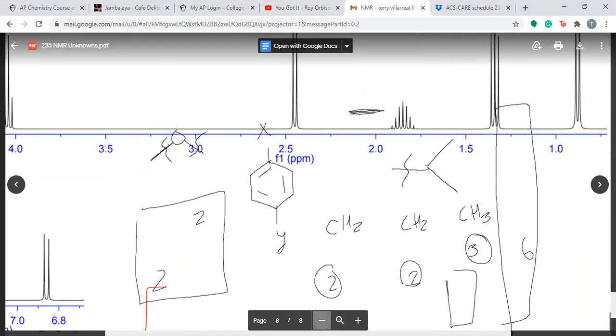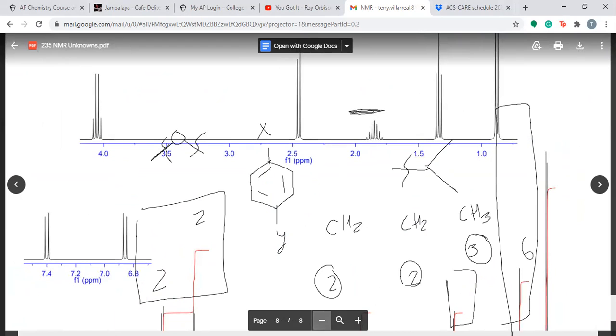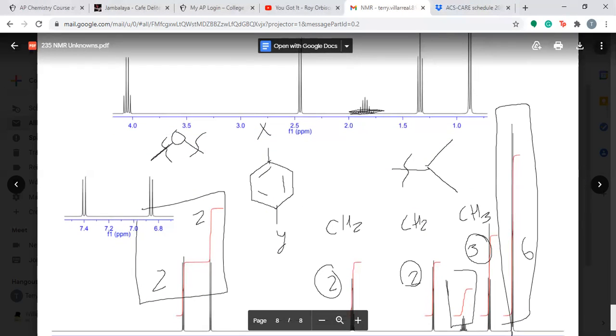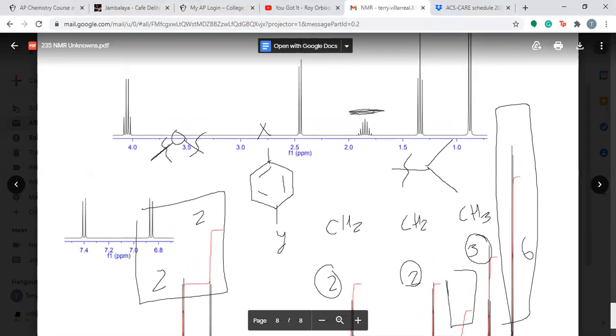CH2. Yep. So now I'm going to have a CH2, correct? Yeah. So now that I know that I have a CH2, as I scroll back down here, which CH2 do you think is going to be the most likely culprit? This CH2 that's a doublet, or this CH2 that's a triplet or a quartet? Quartet. How many neighbors would that CH2 have? No. Just one. I'd only have the one. So it's probably going to be this. Now, can I erase all this information real quick?